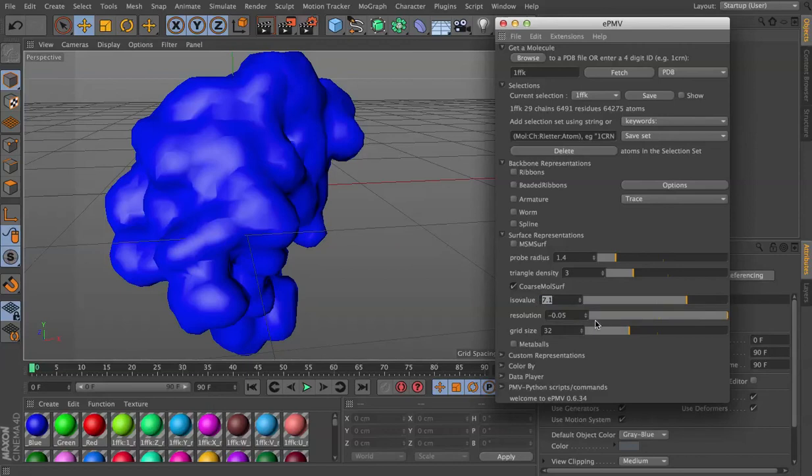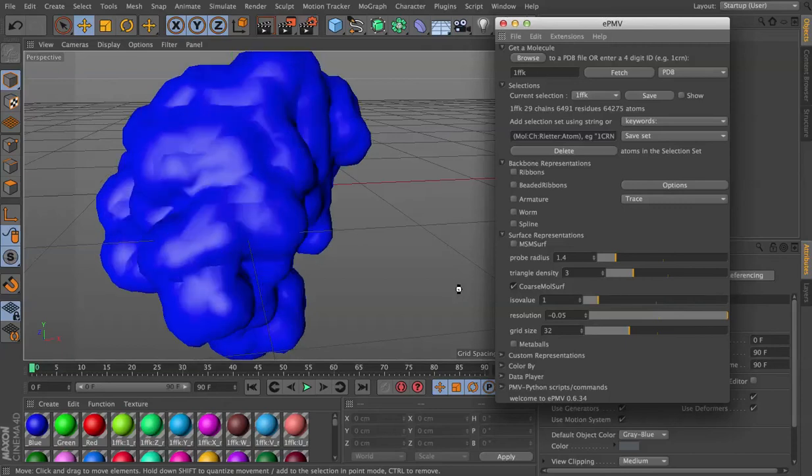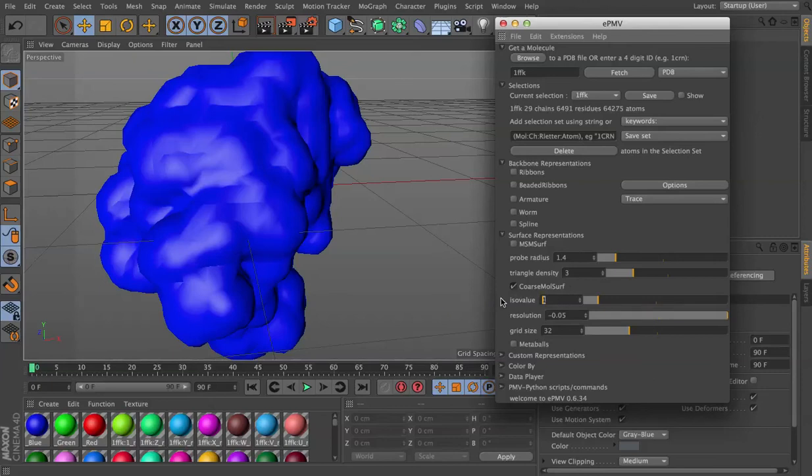And then you can choose an ISO value that gives you the type of lumpiness that you're interested in. Let's experiment with some extremes 1. That's going to puff the surface out even more. I like it back where it was around 7 or 8.